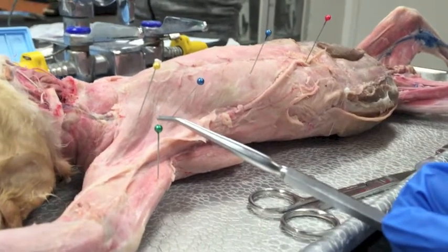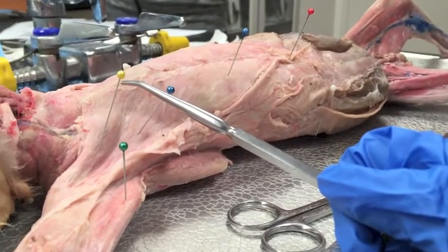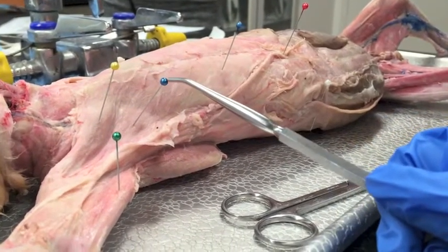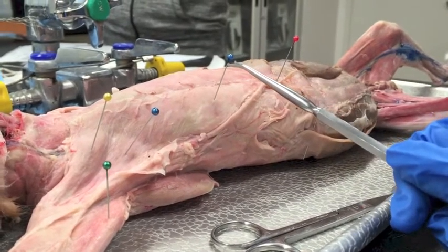It's the epitrochlearis, the pectoantibrachialis, the pectoralis major, and the pectoralis minor.